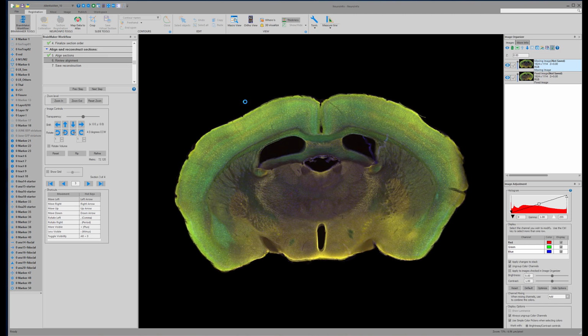I think I've noticed that this alignment is possible for separations of probably, what do you think is an upper limit, 150 microns between them? Yeah, we never have gone that high, but I'm sure that should be fine. I'm just thinking of data I've seen from other laboratories too.